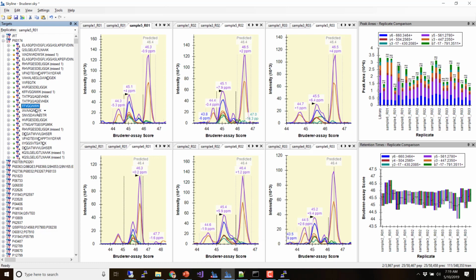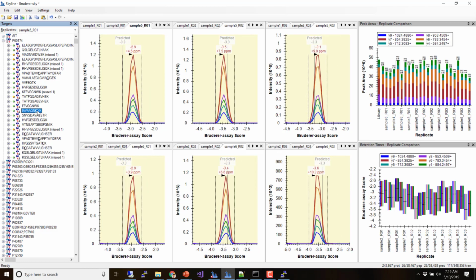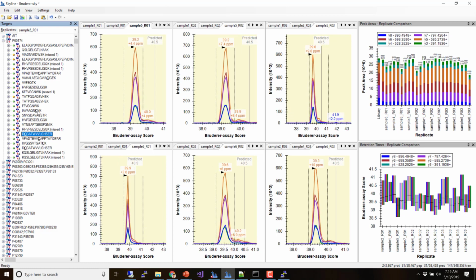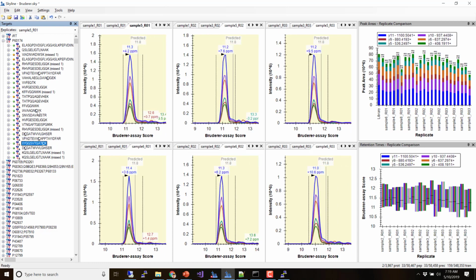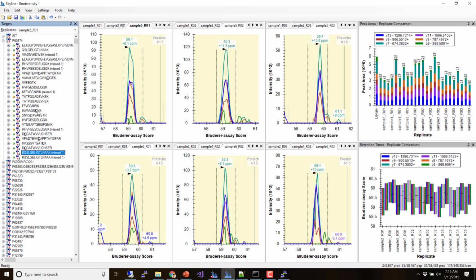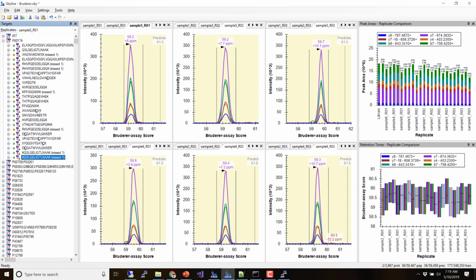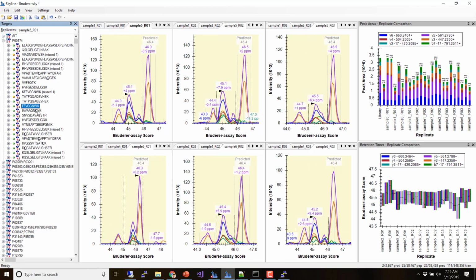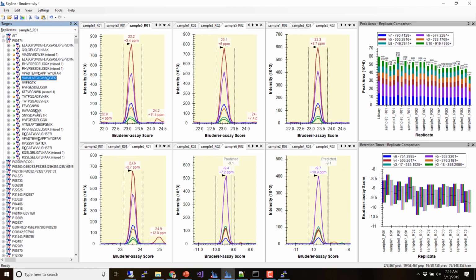And you do have the opportunity to do this cleanup and get rid of them, but if you think about this statistically, this is one of the strengths of doing protein quantification versus peptide quantification. If you think about this protein as a whole, we're going to get great quantitative statistics on it, because we've got, I don't know, like 20 peptides, and maybe 2 or 3 of them have any interference at all that we can see, right? So quantitatively, MSstats is going to have a great time with this.